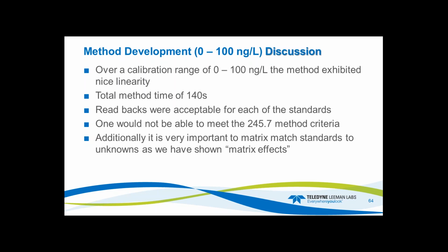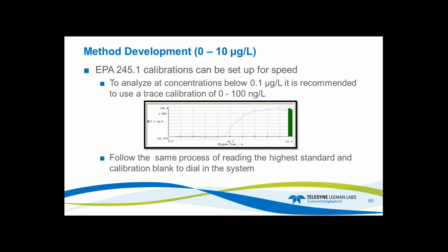That has to have a method detection limit, instrument detection limit, method detection limit of 1.8 nanograms per liter. We wouldn't be able to achieve that with this system. And again, it's very important to matrix match those standards with the samples for the method development.